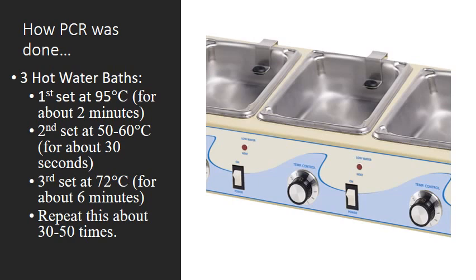of this PCR step. And not to mention, you have to do this anywhere between 30 to 50 times if you're using the old equipment, because sometimes those reactions don't make copies if you don't time them exactly right. So you have to do it anywhere between 30 to 50 times, and oh, that will take you all day long. And if you're in the lab for 3 hours, that's pretty much all you're doing when you're doing a PCR step. Let me tell you how nice we have it now.